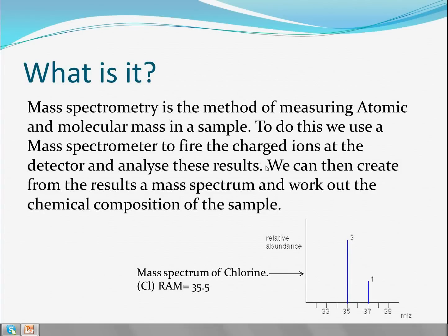Okay, hello everybody. Today we are going to explain how the mass spectrometer works, and especially looking at how it pushes the ions along and how that works. There are two main ways of doing this, so I'm going to show you today how we do this.